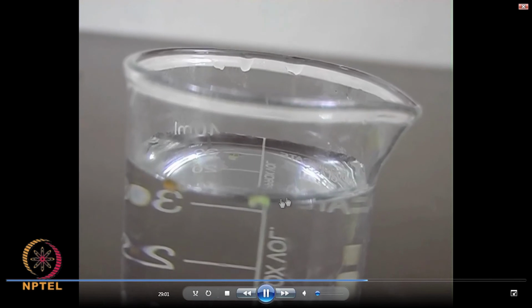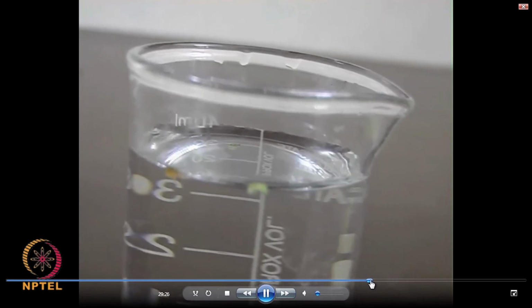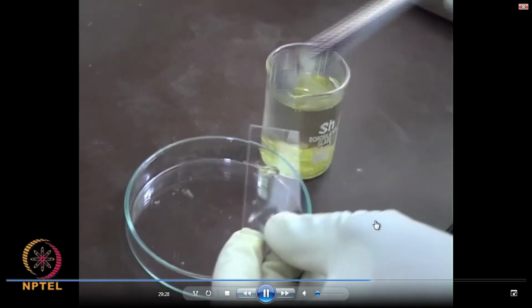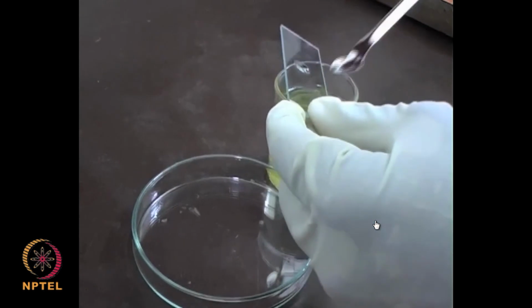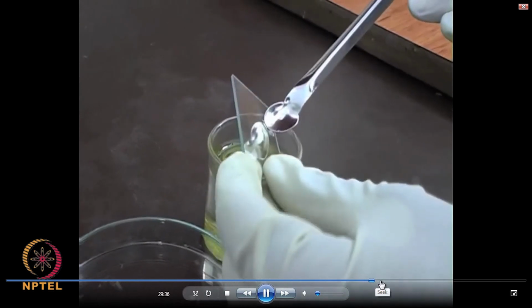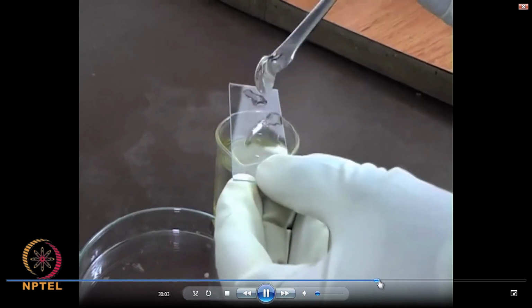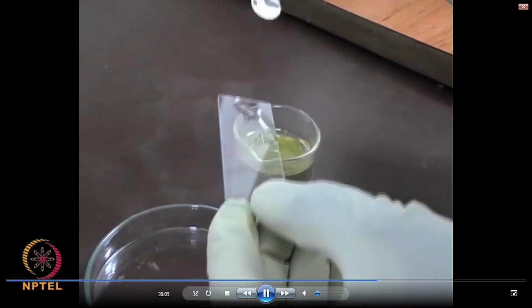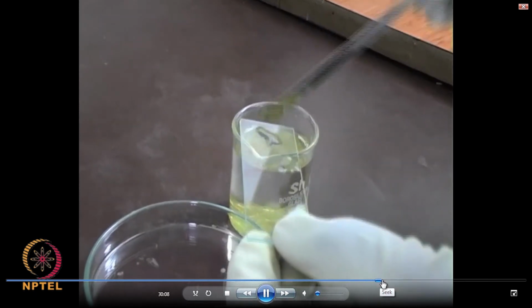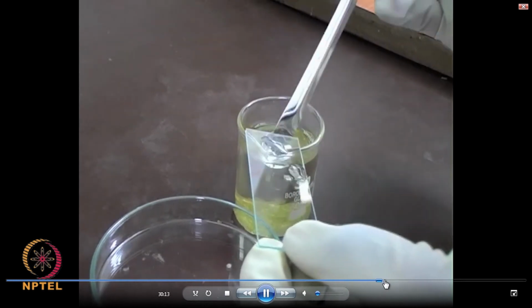You take up one of these slices and put it on a glass slide. First you place some water drops in order to hold that slice intact, and this is how it is done. You can put 2-3 places of water like this, and then keep one of the cross sections taken from the plant stem, and now we will see how it appears on the glass slide.